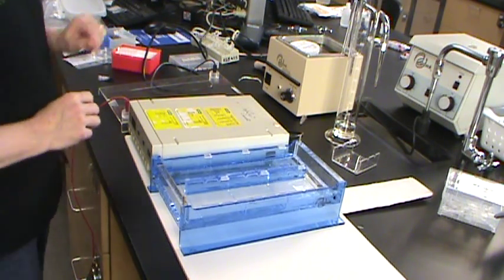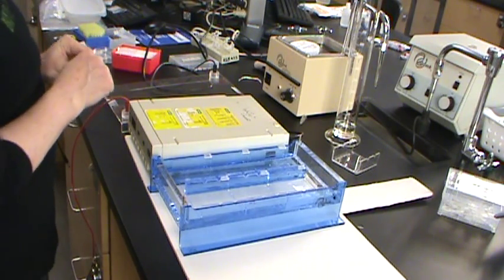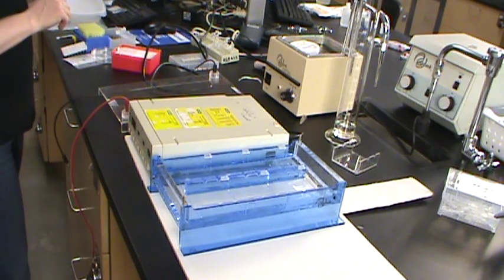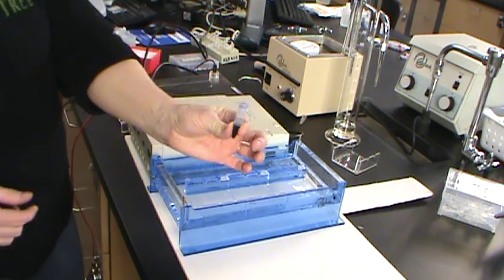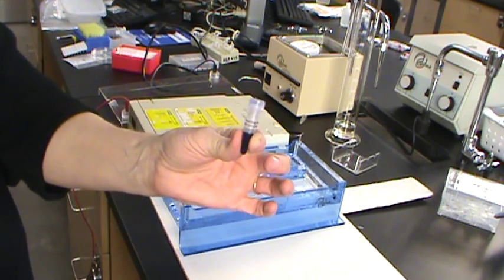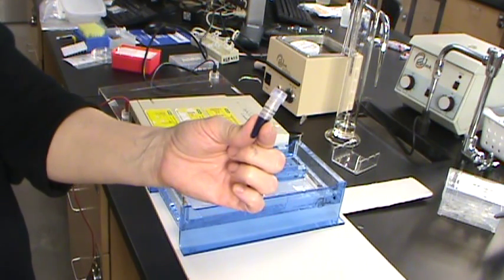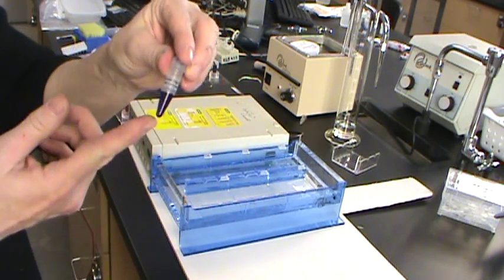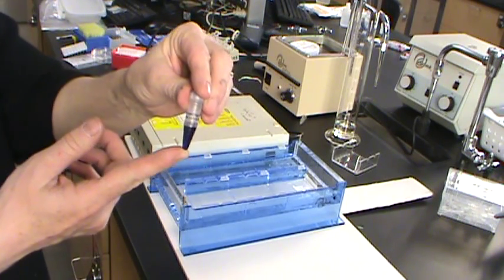Well, we want to stop our samples from reacting too far at the end of that 30 to 60 minutes. And so what we'll do is we will add this gel loading solution. This gel loading solution has reagent in it that will denature the enzyme, so it will stop that enzyme-catalyzed hydrolysis of the DNA. And it has a dye in it that will migrate faster than anything else in our samples on our electrophoresis gels.